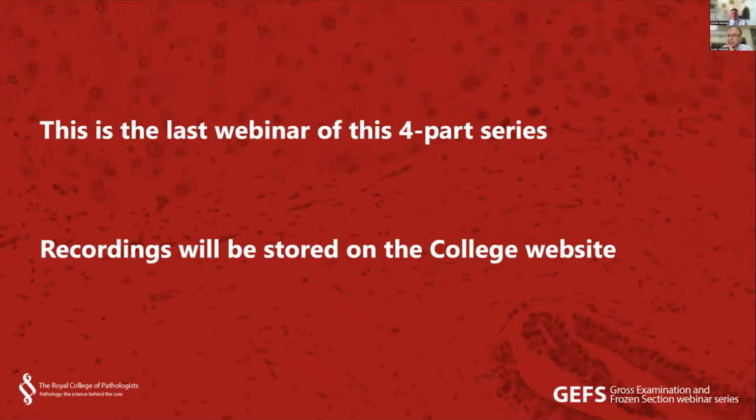Okay, right. I think we'll stop at that. But some of the questions you've probably answered partly in the initial phases of our talk. Maybe I'll just ask one question, because recently our clinical colleagues in our hospital are telling us that even if we have a complete pathological response in colorectal carcinoma specimens, the location of acellular mucin is finding importance prognostically, whether it is in the submucosa, muscularis propria, or pericolic or perimuscular adipose tissue.